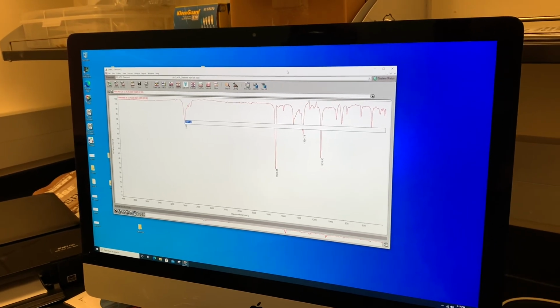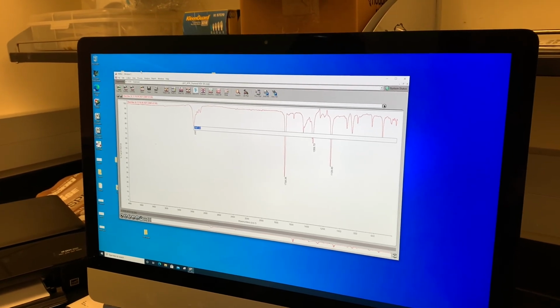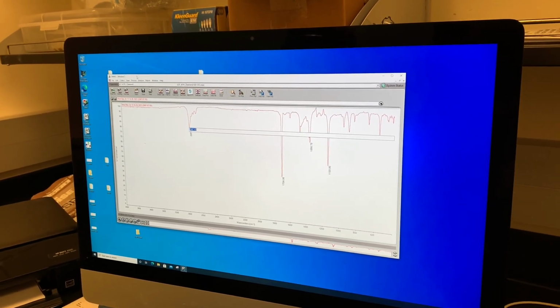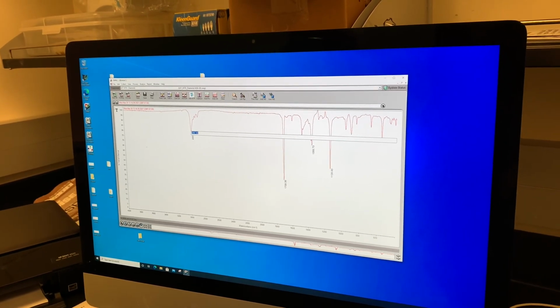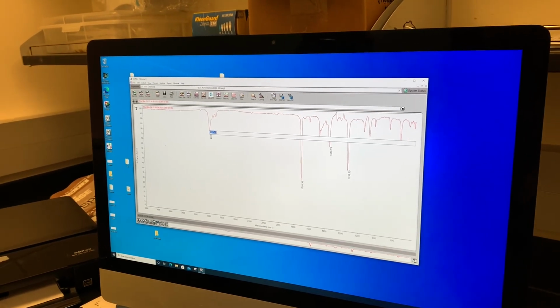And then we are going to identify the molecule based on proposing a mechanism for this reaction, theorizing what could actually be happening, and then matching that proposed product up with this particular IR. So I'm just going to save this so that we have this as reference, and we will work next on identifying the product.